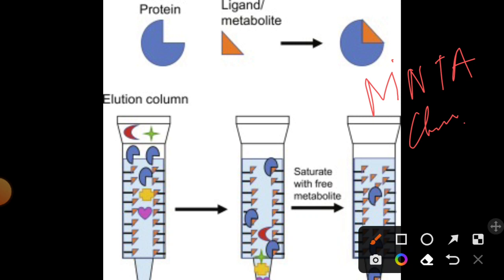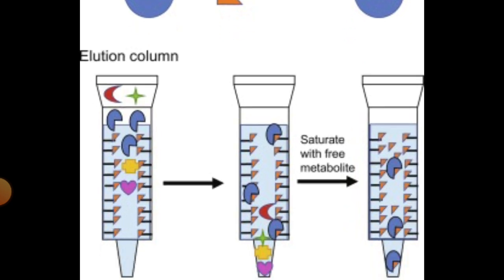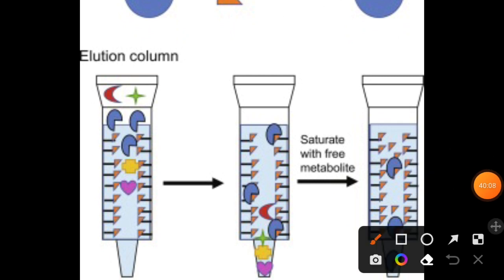In this affinity chromatographic technique, we are using chelated nickel atoms. I will discuss how after explaining the basic concept of affinity chromatography. So here in the solid phase we are using a gel matrix, which is nothing but agarose gel, and which contains the ligand specific for the protein that we want to separate from a mixture.